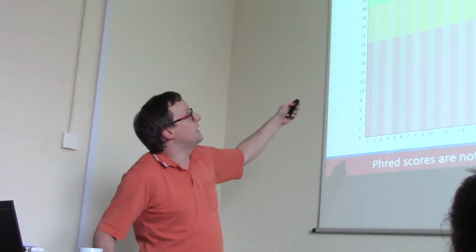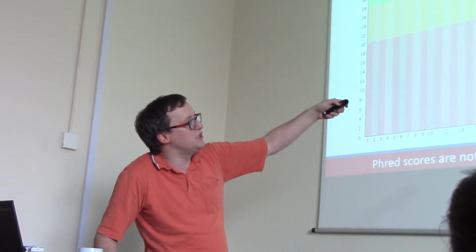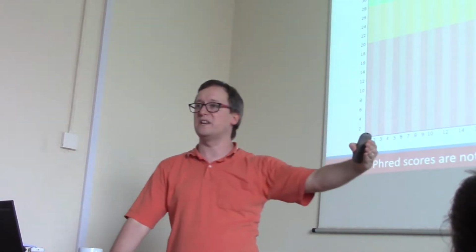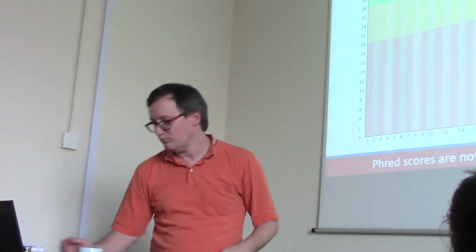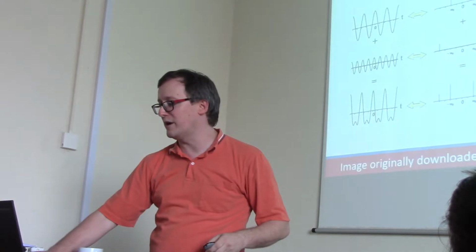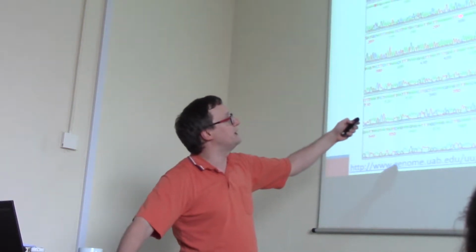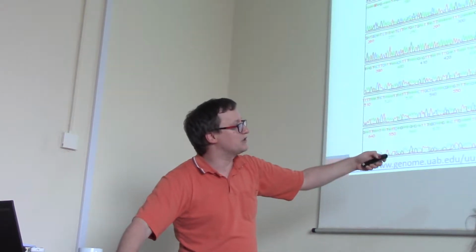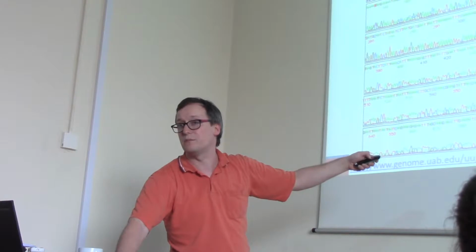So here we can see then that we're getting a slight diminution as we go to higher and higher base numbers within a read of increasing error. If you think back to our electropherograms just a moment ago, you saw that our ability to separate next door neighbors started vanishing, especially as we got to these really high base numbers.